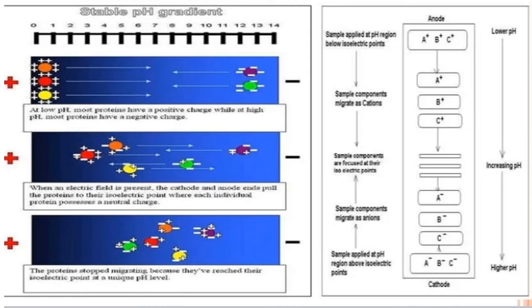As we are moving now towards the anode, we are seeing that one positive charge has been introduced. As we go downwards, it has also reached a point whereby we have three negative charges and three positive charges. If we have a look, a positive and negative will cancel, positive negative will cancel, positive negative will cancel. So at this point, we're expecting the net charge to be 0.